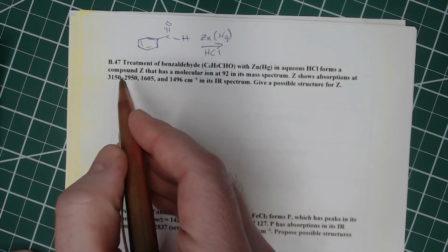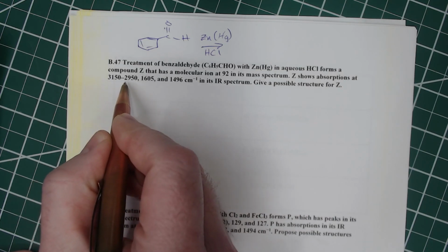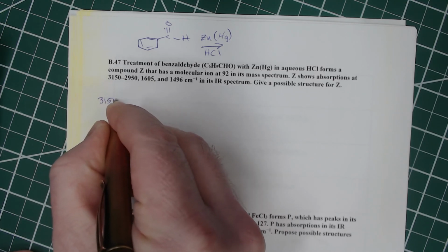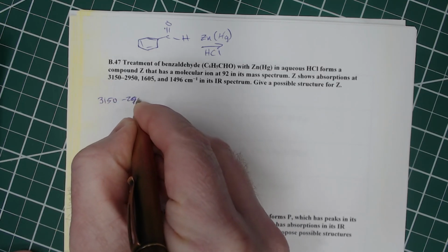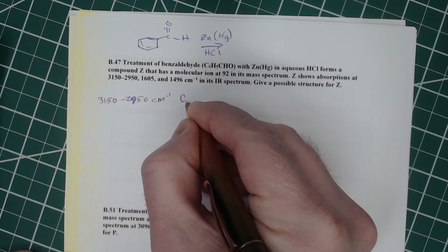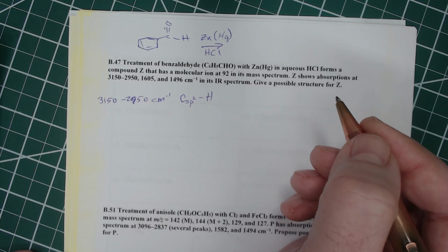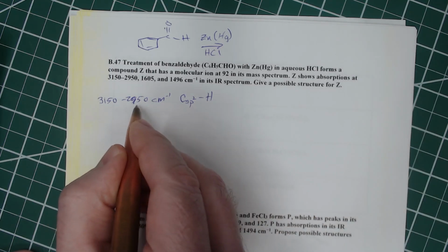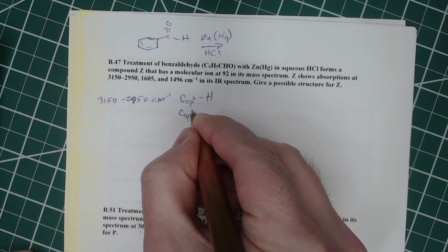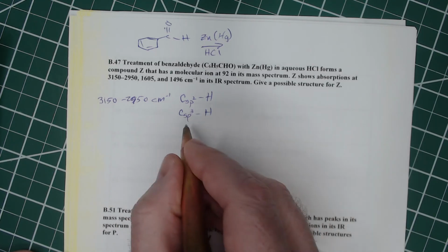All right, so let's look at the peaks that we have. We've got absorptions that go from 3150 to 2950 reciprocal centimeters. That tells us we definitely have sp2 hybridized carbon-hydrogen bonds. But because it goes below that 3000 mark, to the right of it, that means we probably have sp3 carbon bonded to hydrogen. So we have the carbon-hydrogen stretching there.